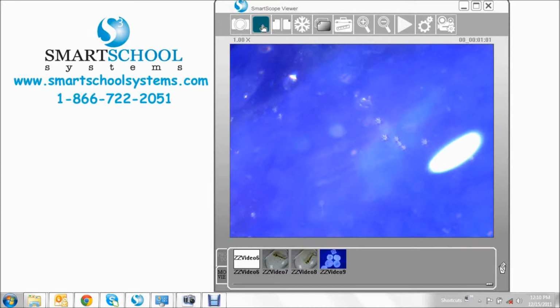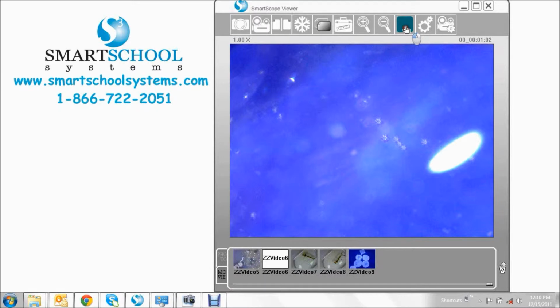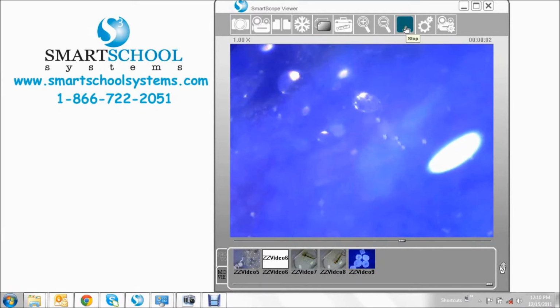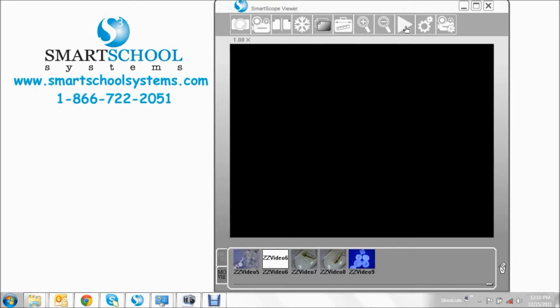So we've recorded for about a minute, so I'm going to press stop. I'm going to press play to play that video back. And you can see that time-lapse recording of that salt dissolving.